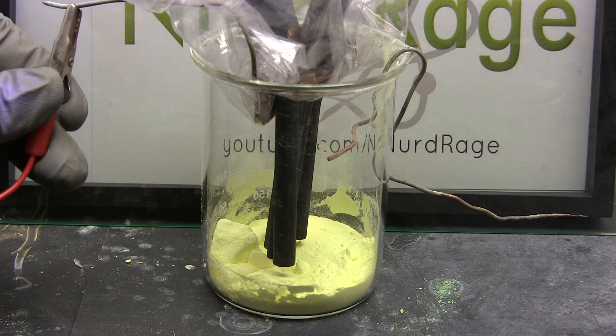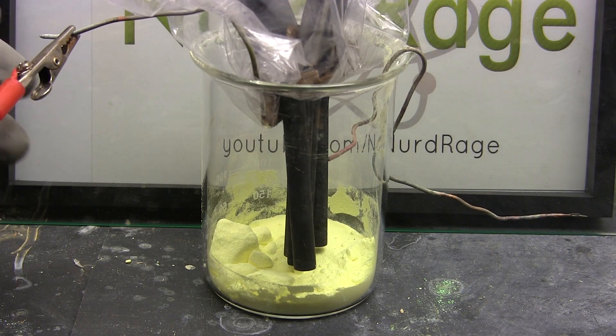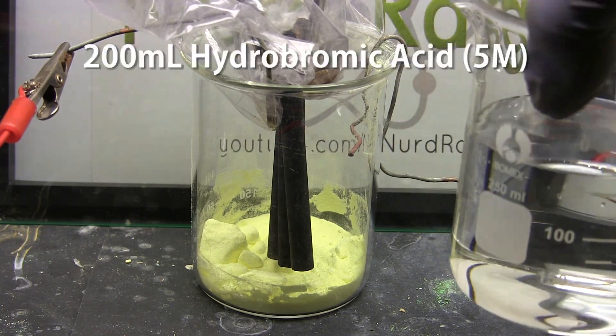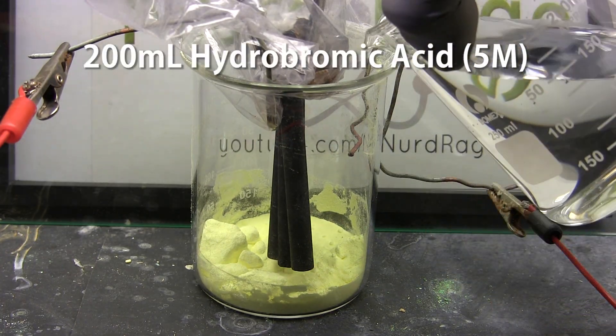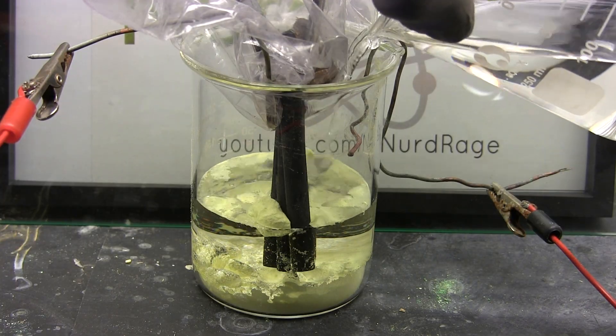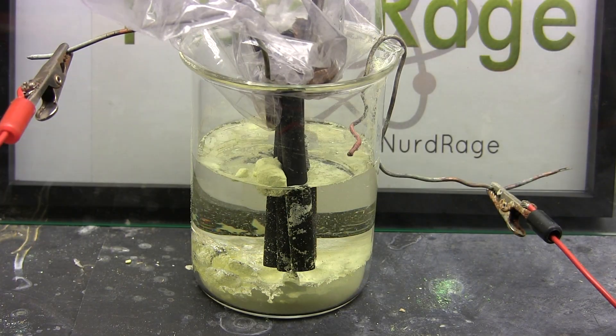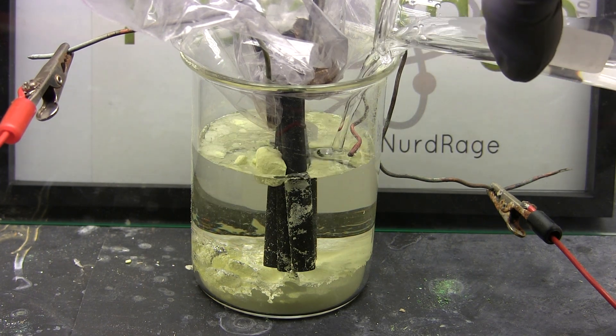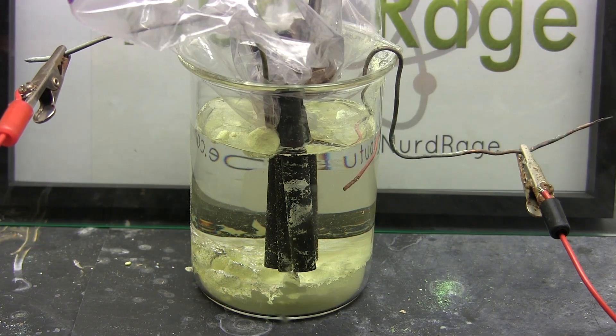Now we clip on the power leads. Positive for the anode and negative for the cathode. Now we add the electrolyte which is 200 milliliters of a 5 molar solution of hydrobromic acid. Make sure the carbon electrodes are submerged to at least 5 centimeters depth and that the copper electrode is under the surface of the electrolyte.